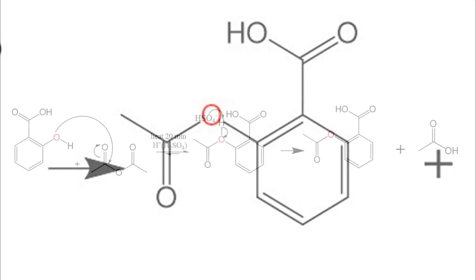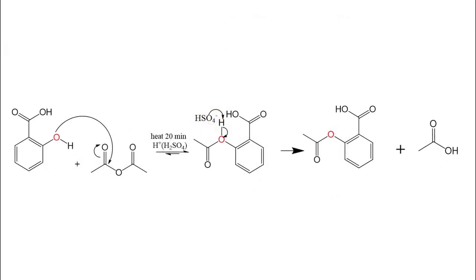What we are hoping for is a negative test. Our sample should not turn purple.